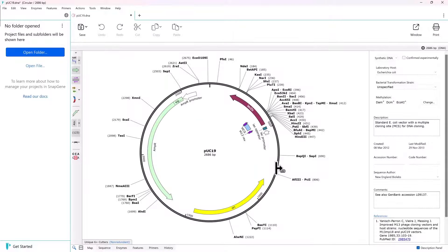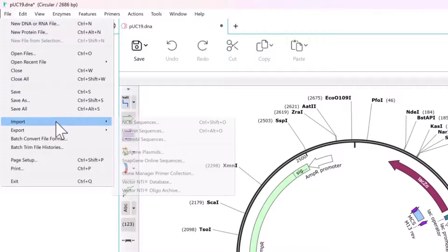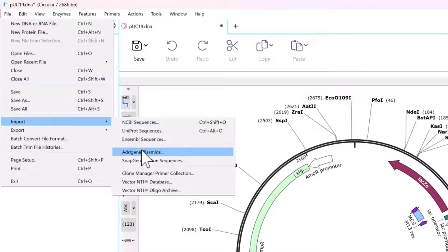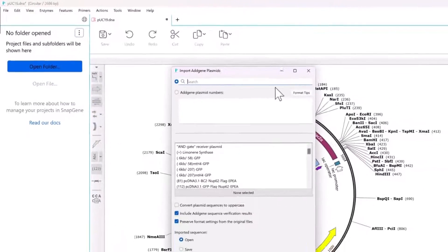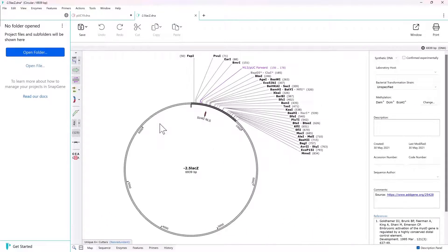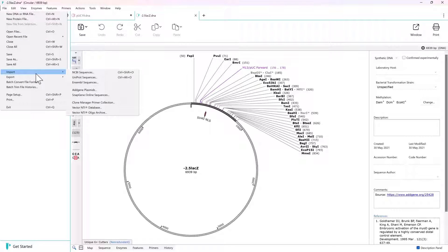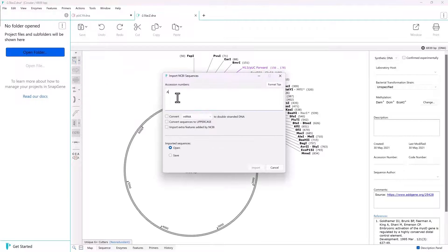You can also do these tasks from the main SnapGene interface by selecting File. This includes importing Addgene plasmid sequences, or any published sequence from NCBI, Uniprot, or Ensembl, using the appropriate accession number.